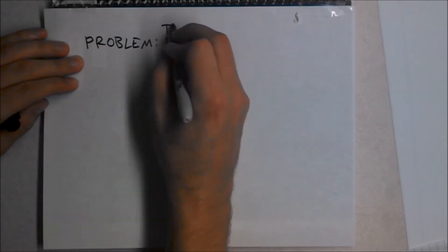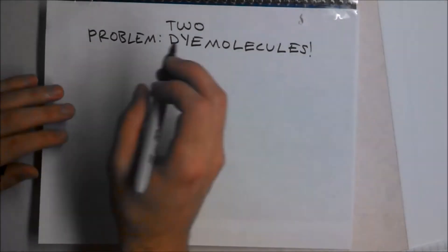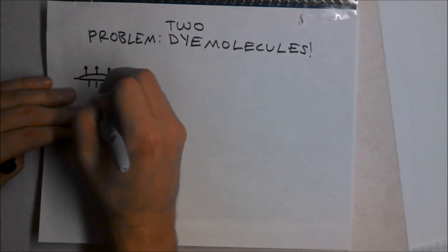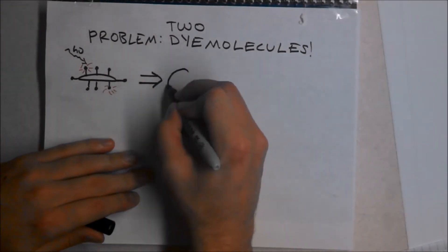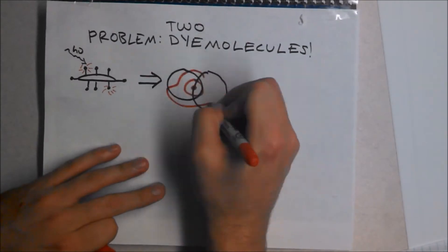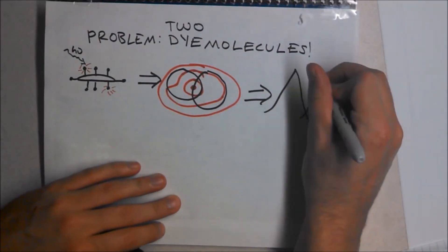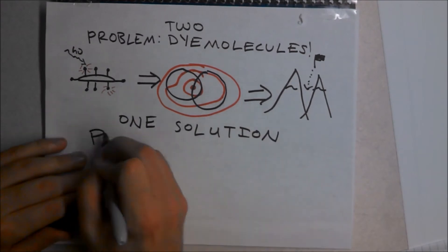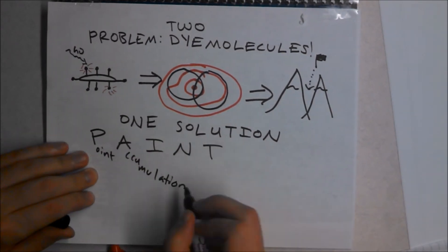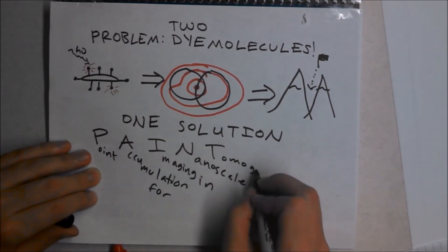A problem arises when more than one dye molecule is excited. The intensity of the fluorescence from two dye molecules causes a maxima between the two peaks, distorting the image created by finding the peak intensity. One solution to this problem is to use PAINT, or Point Accumulation for Imaging Nanoscale Topography.